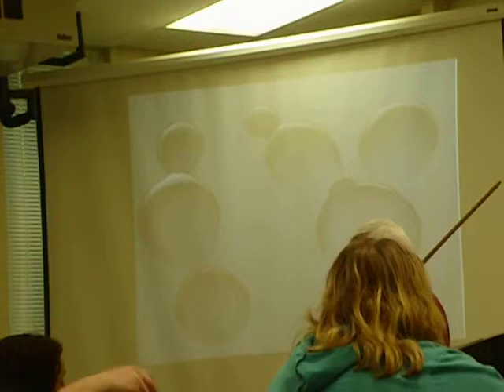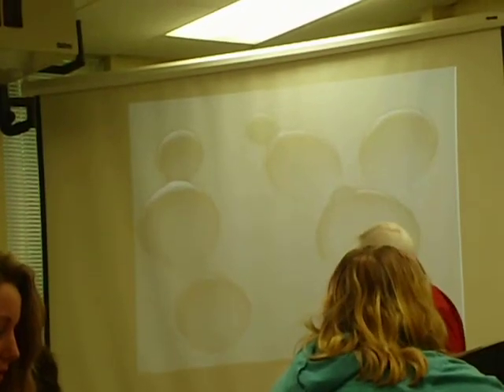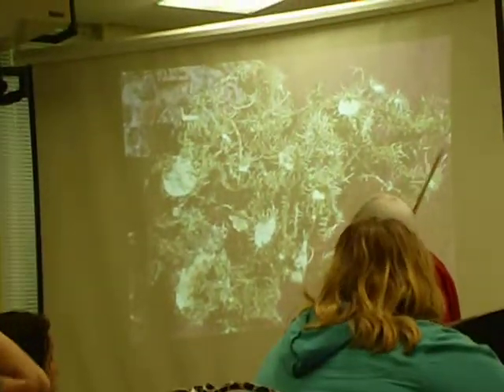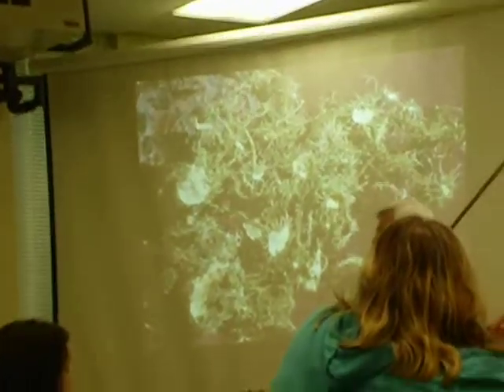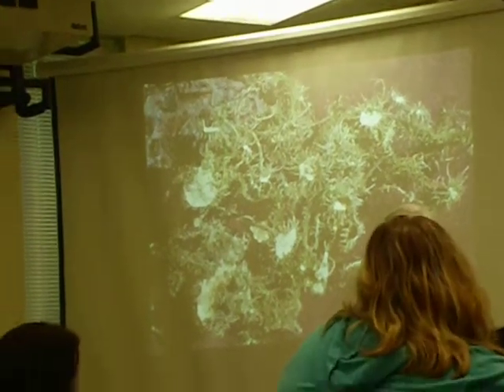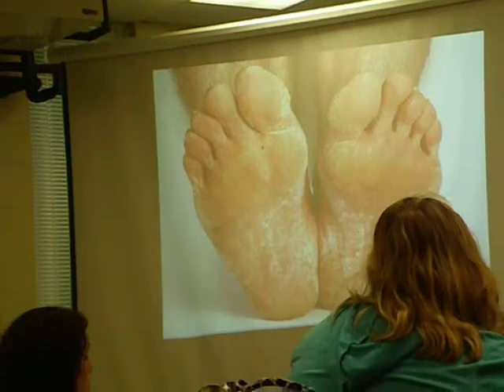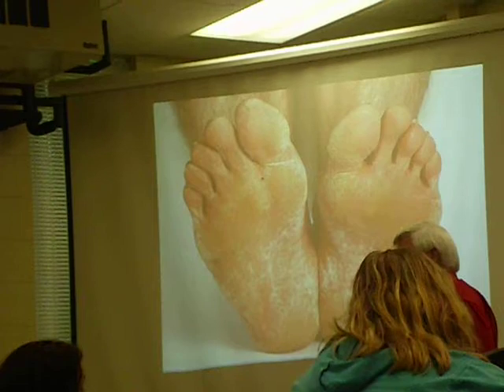Good. Yeast. Okay. What are these? Common name. Yeast. What division do they belong to? Ascomycota. What process is taking place here? Budding. Is that sexual or asexual? Asexual. What's this? What body form? Fruticose. Moss. What division is represented here? Deuteromycota. What disease is called?